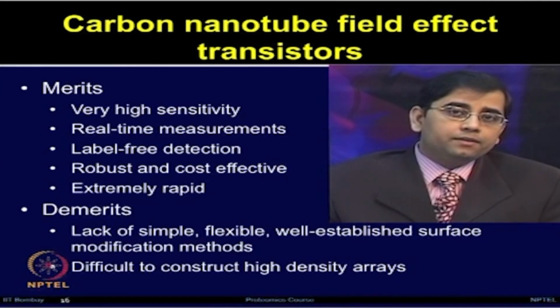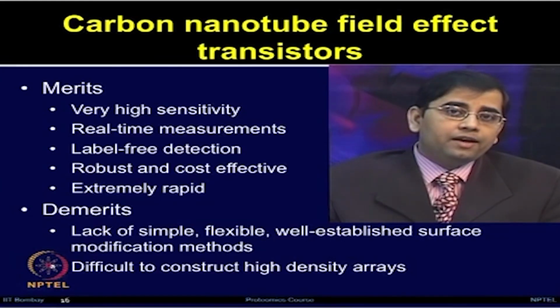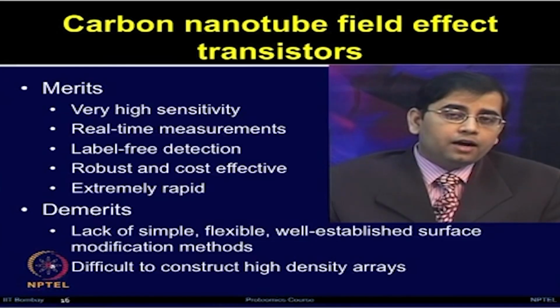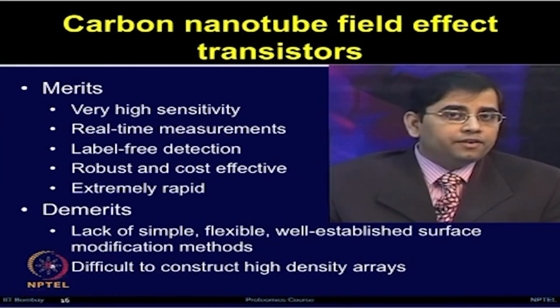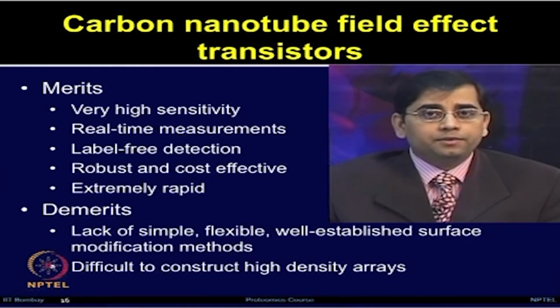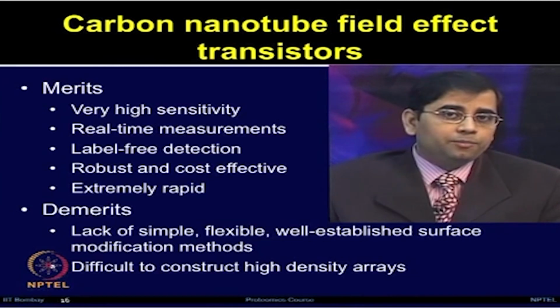Again, in the proteomics field, there is an increasing interest to apply various types of label free techniques as well as nanotechniques and couple them with the high density, high throughput array platforms, so that one can not only monitor the reactions in a very low volume in real time in a label free environment, but also identify or study thousands of biomolecules at the same time on the same chip platform. Therefore, there is an increasing trend of applying various types of nanotechniques also with the array based techniques.